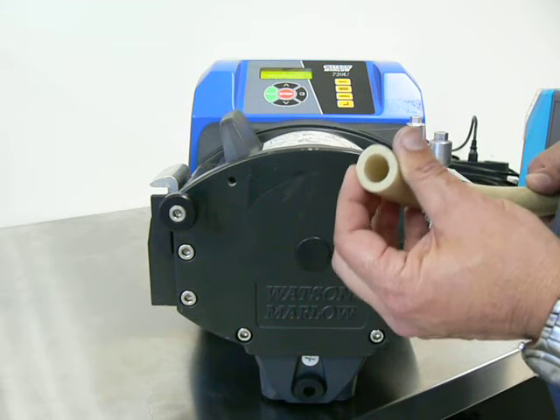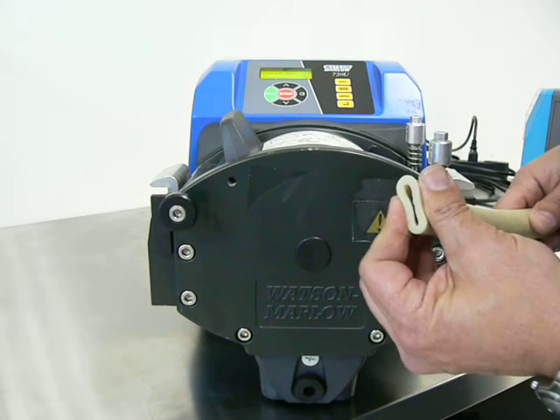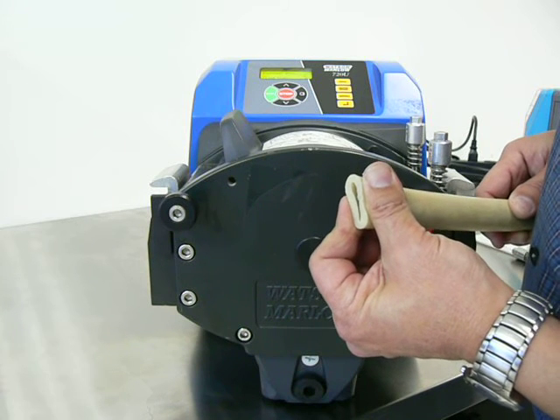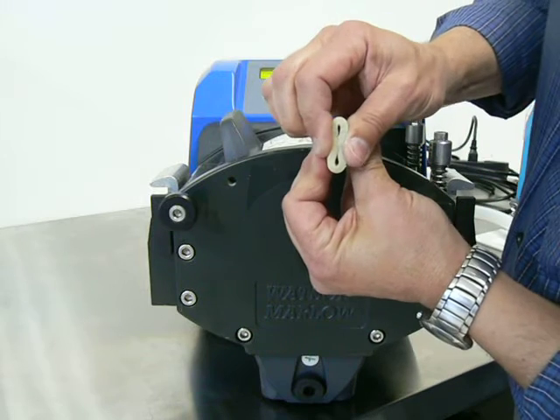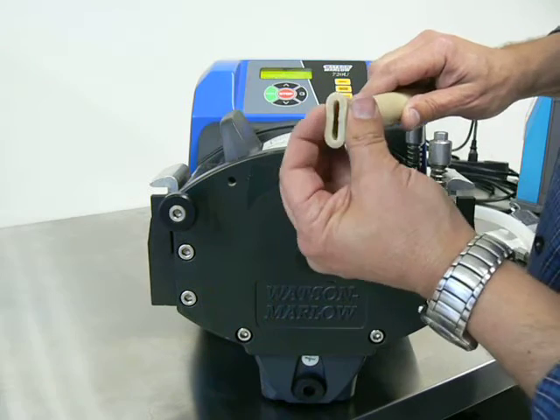It's the same as 3/16ths inch. The air gap in the pump, between the pump rotor and the lid, is set for this. Two 4.8mm walls that are compressed together give a distance that the pump is designed to look for. That's why the ID is not important — the wall thickness is.